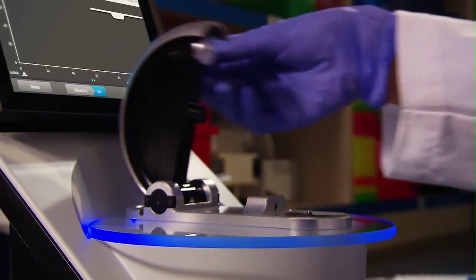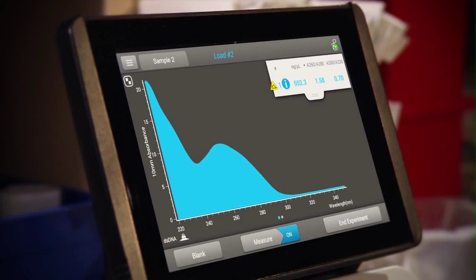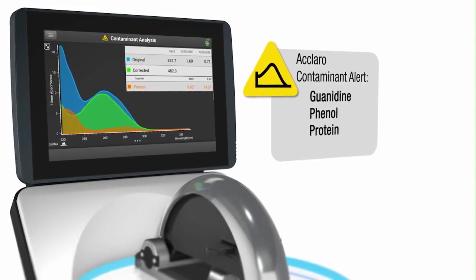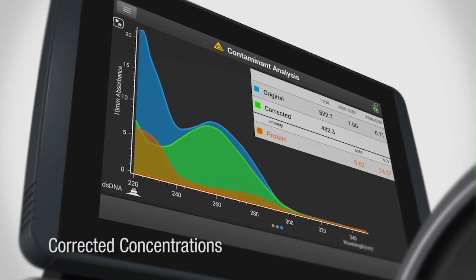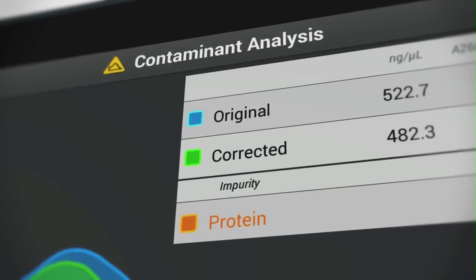ECLARO data analysis ensures that your sample is accurately qualified and quantified. ECLARO identifies sample contaminants, automatically providing a corrected concentration value so you can avoid spending days troubleshooting failed experiments.